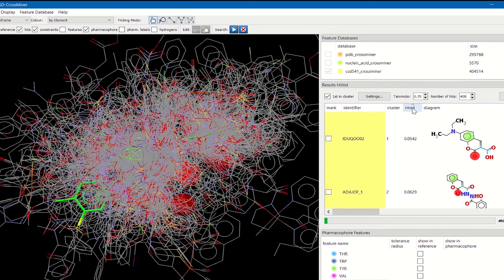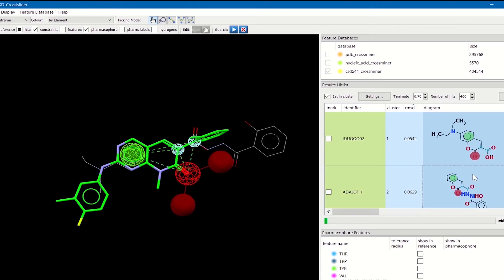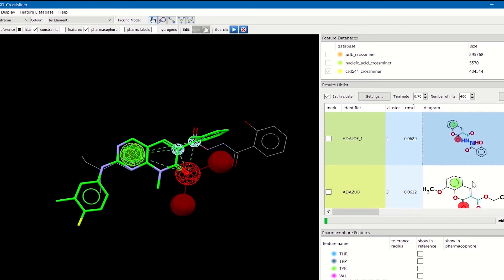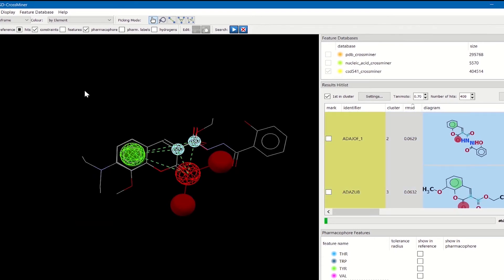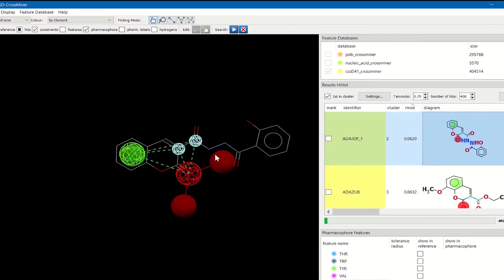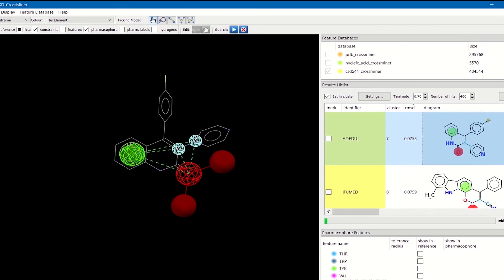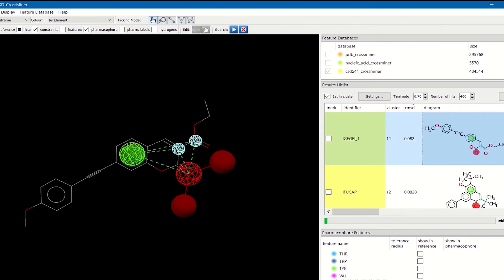Let's take a look at the matching hits now. We can sort by RMSD, and we can click on individual hits or select multiple hits using the CTRL-SHIFT button. Let's hide the reference and take a look at the chemistry here. We see that the hits matching the pharmacophore query have a central ring that is different from the original one.